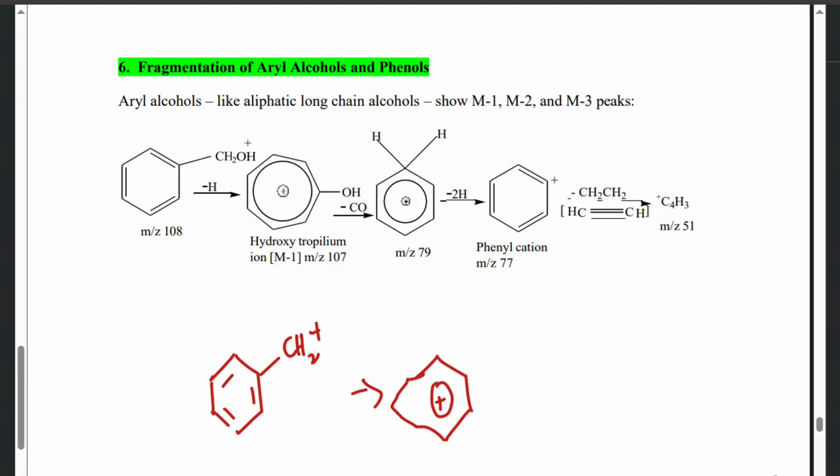So also here, when we have CH2OH, we can also write it as a 7-membered ring that now contains OH, right? So this one leaves as, okay, this CO therefore leaves. The 7-membered ring, all these are carbon. So this C and O leaves, and then this hydrogen is joined to the ring there. So like this, CO leaves.